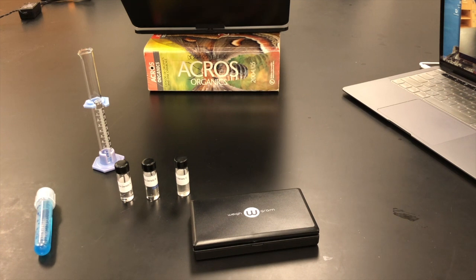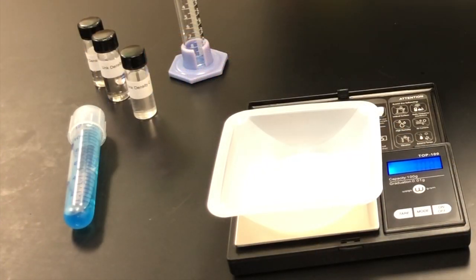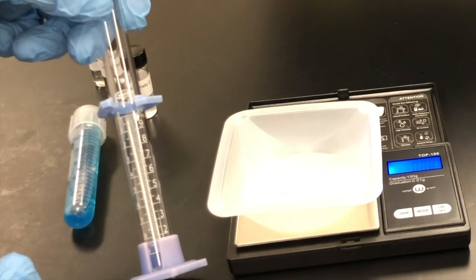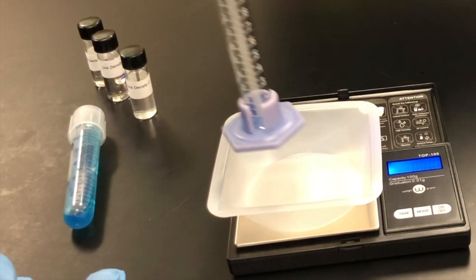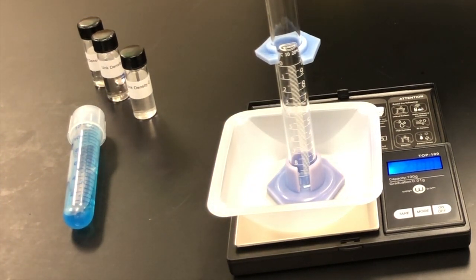I've got a variety of 10 mL graduated cylinders. That way I don't have to keep washing them. So with the weighing boat there, it's 3.02 grams. I'm going to tare it. Now it reads 0. What you want to do is get a clean graduated cylinder. Make sure there's no residual liquid in here. And then you want to weigh it, because you want to determine the mass of the liquid. Okay? So right now I have a mass of 21.71 for the graduated cylinder.